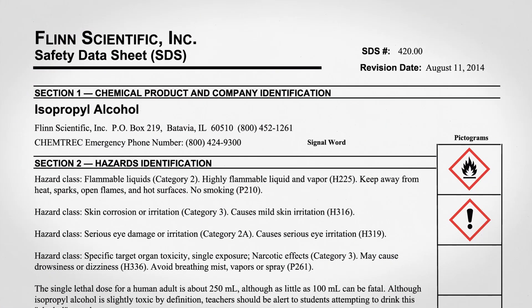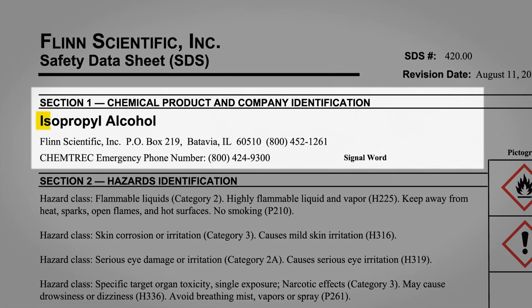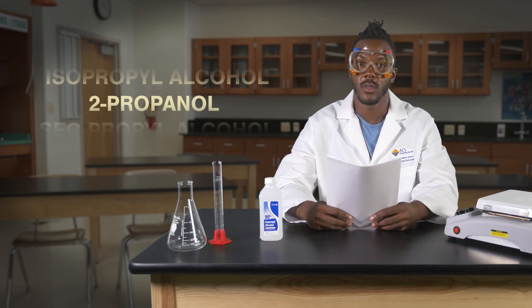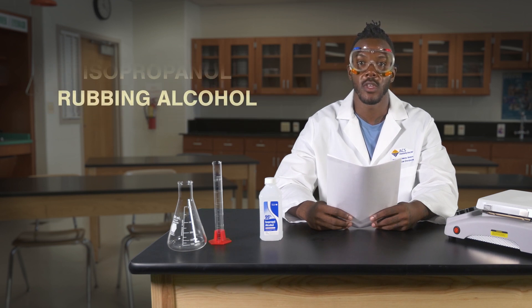All Safety Data Sheets have the same 16-section format. The first section identifies the chemical and also gives the name and address of the manufacturer. Chemicals are known by different common and formal names, so if you're unsure about which chemical you're using, check to make sure the name of the chemical on the SDS matches that on the container.